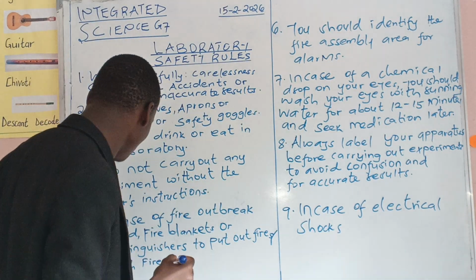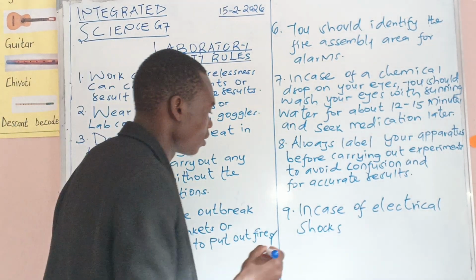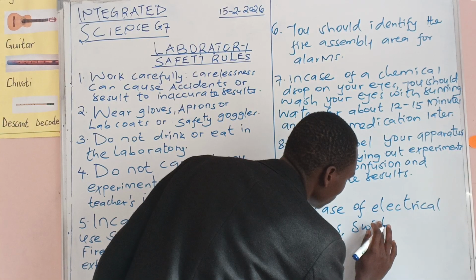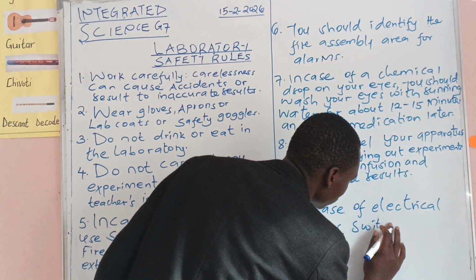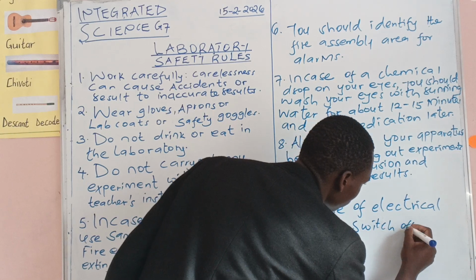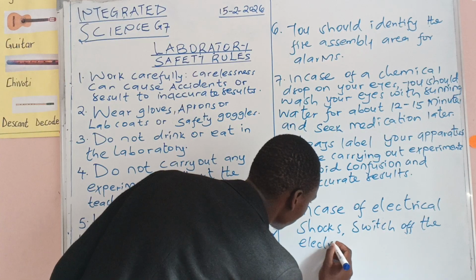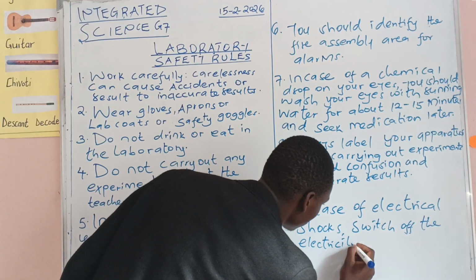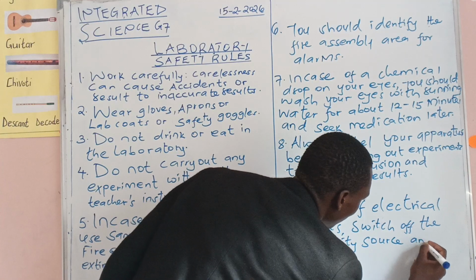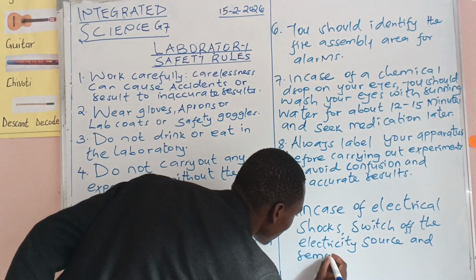So you have to make sure you switch off the electricity source and remove the casualty.